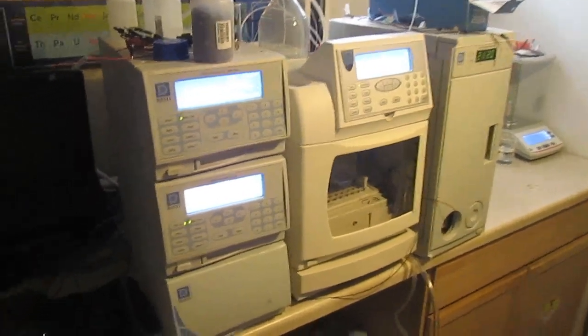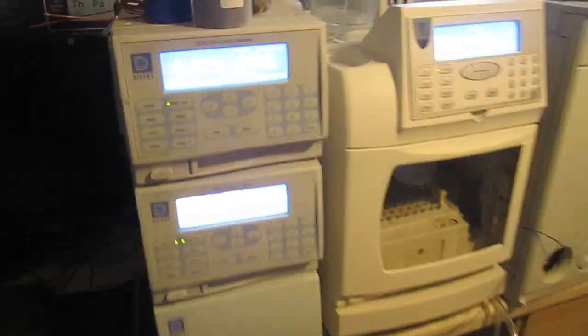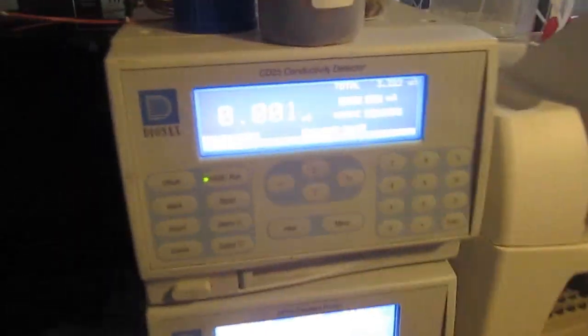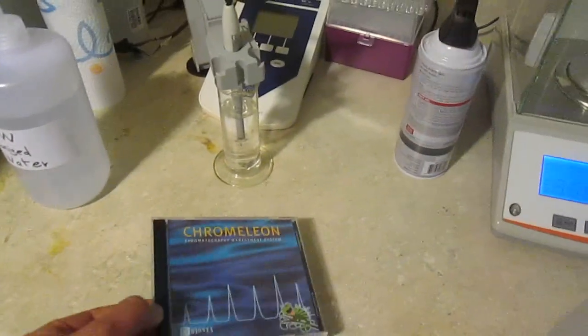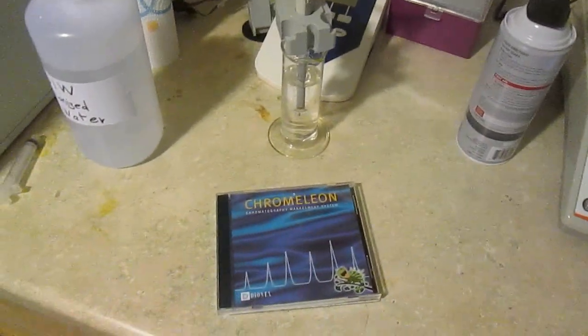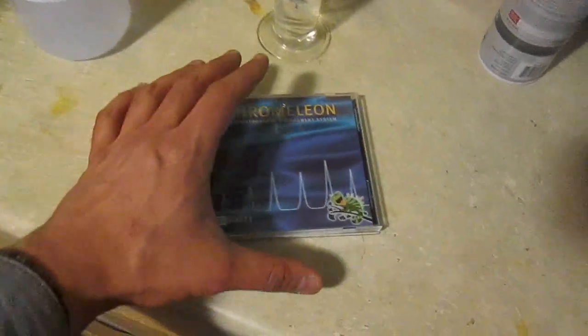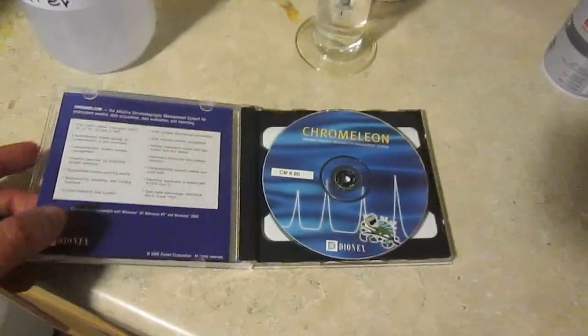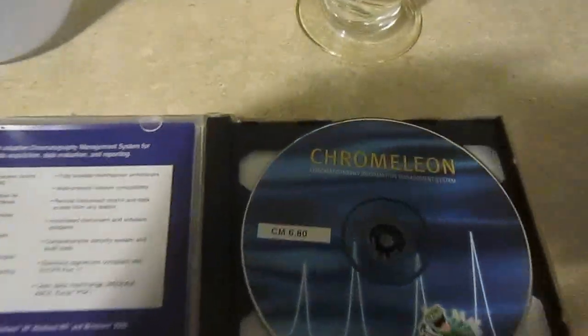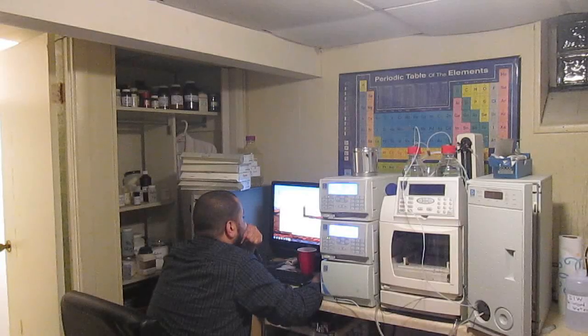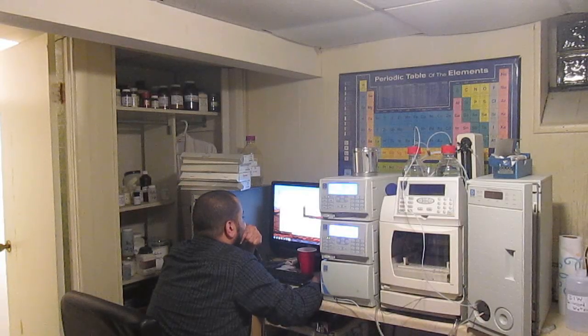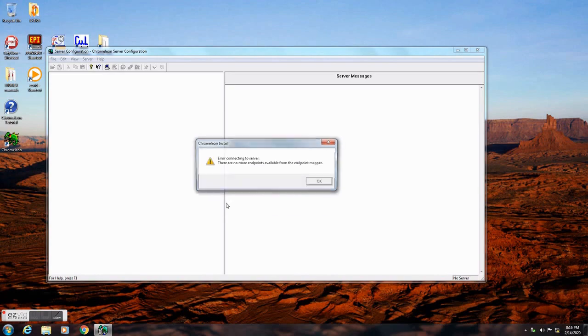For now though, this instrument seems to be working fine. And the last piece I'm waiting on is the control software, and this might be the single most expensive part of this project. As you can see, this is still a work in progress. So stay tuned.